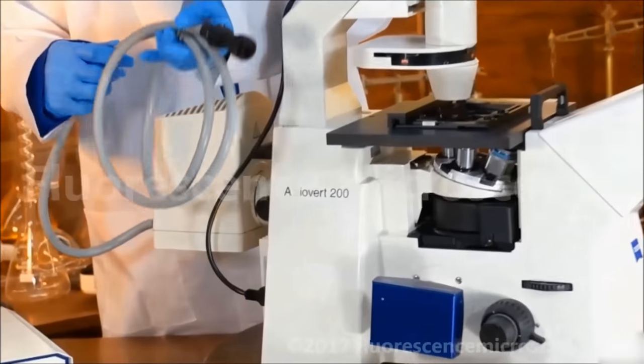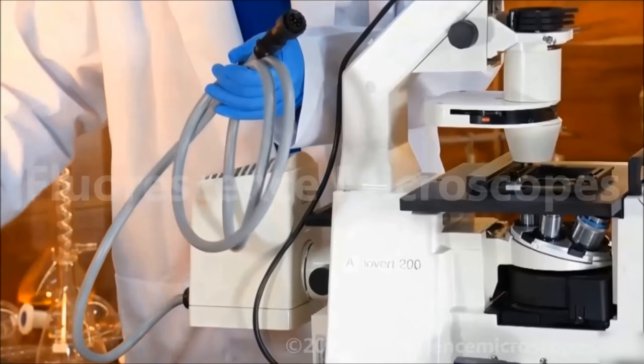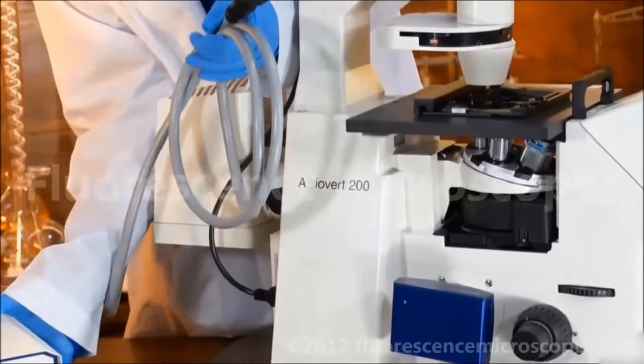This is the cable for the mercury system, connects the lamp housing to the transformer.